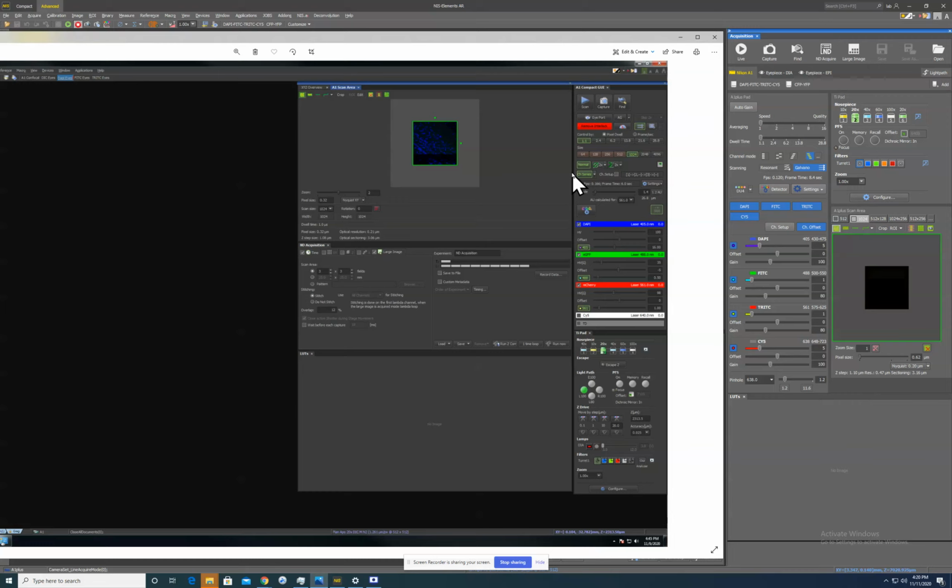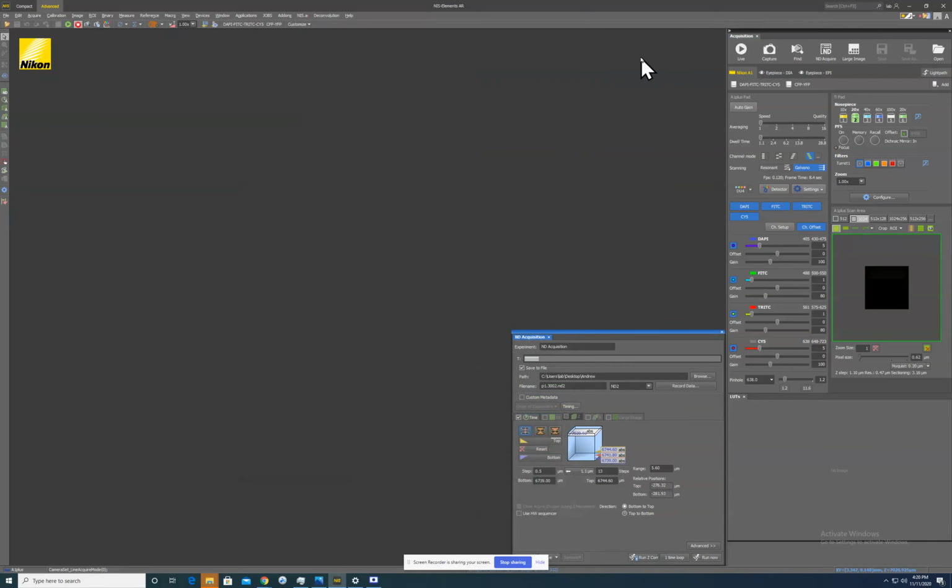The reason why you would want to do it like that is because you have fluorescent markers where if you just turn them all on at the same time and you collected all of the information at the same time, that's just going to be a mess and you won't be able to really differentiate between anything, especially if you're doing 4-color imaging, which a lot of people on this system are. But if you're not doing 4-color imaging, then you don't need to have that channel series turned on. The only benefit to not having it turned on is that it goes faster, but a lot of people can't use that. Anyway, channel series is right here.